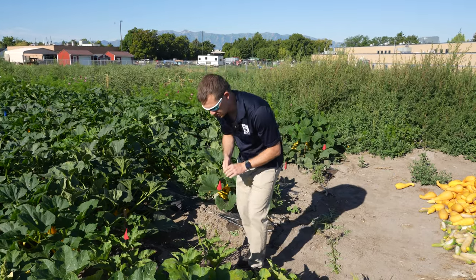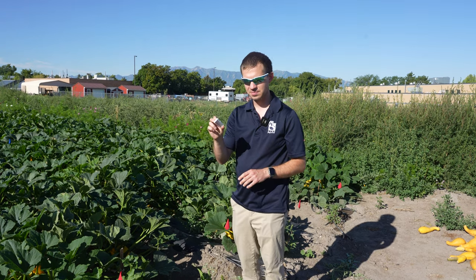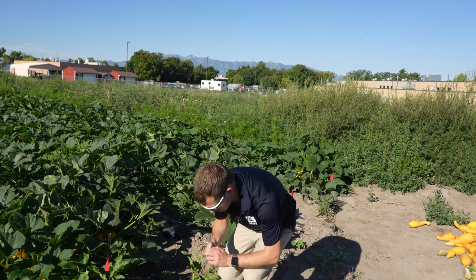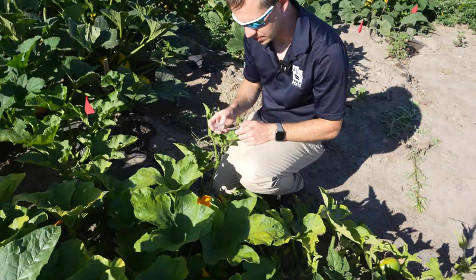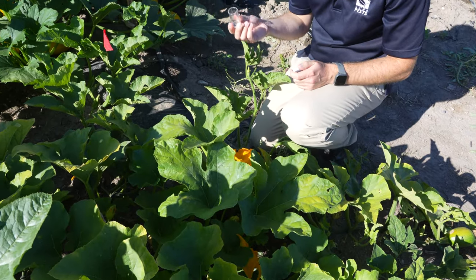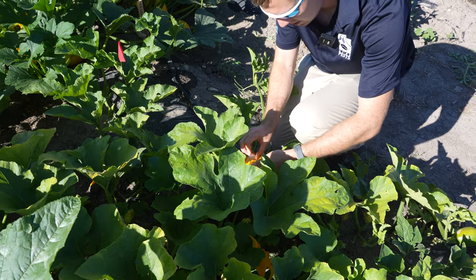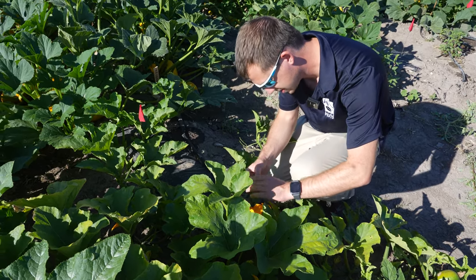For insects, you want to be sure that you're using something that will gather the insect without it potentially biting or stinging you, in case you are collecting a biting or stinging insect. Here we have an insect I'm curious about inside this squash flower, so I'm going to use this vial because it looks like some type of bee, and gently get it into the vial so that it cannot sting me in the process.